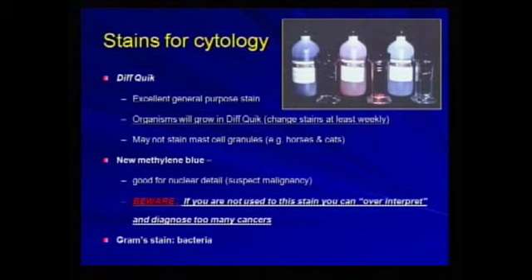There are a number of stains for cytology, and your laboratory should be equipped with all of these. The Romanowsky stains, such as Diff-Quik, are an excellent general purpose stain which will give you good information on most of your cytologies. Realize that the biggest problem that we have in our laboratory with the use of Diff-Quik or like stains is twofold.